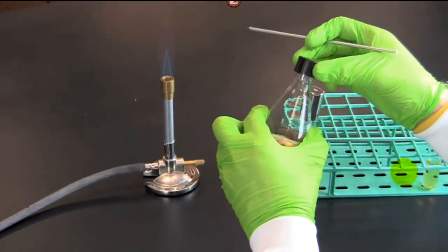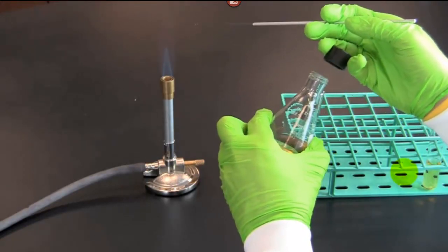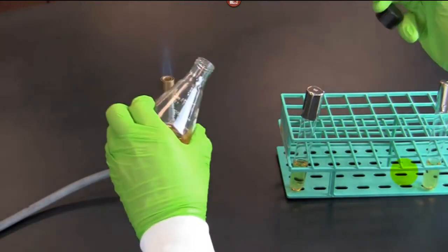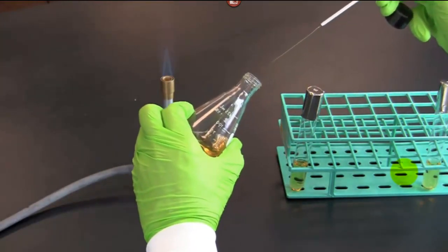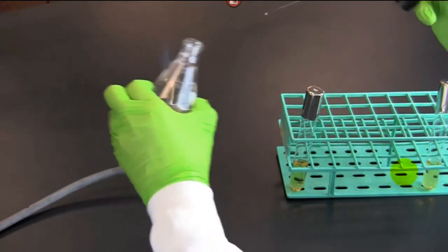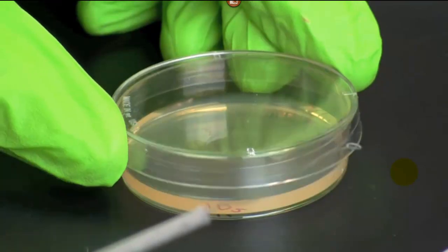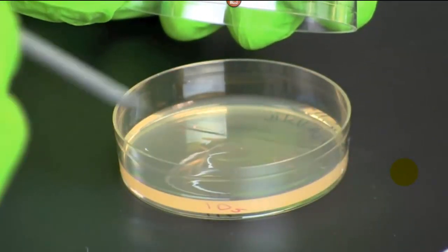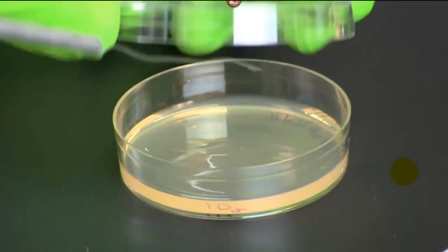Now this is one example. I'm going to show you another video where you do this, but if you're going to transfer cultures, you're using what is called aseptic technique. So here he's heating the barrel of a bottle. He's holding the lid in his fingers, and now he inoculated his loop. He then heated the barrel again. Now he's placing the lid back on it because you're trying not to contaminate. Now he is streaking an agar plate. See the agar on the bottom, the lid on the top.